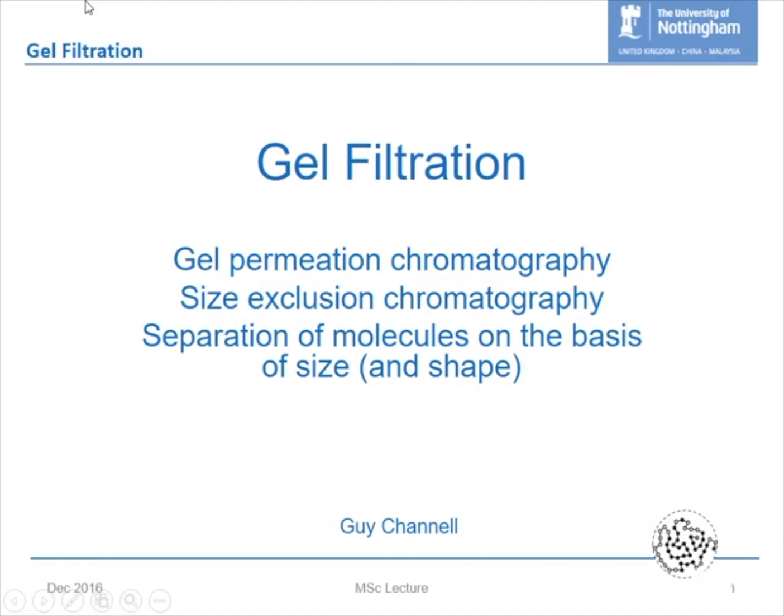Good morning, everybody. I'm going to talk this morning about gel filtration. Like many techniques, it often has a number of different names that you can use. We've got gel filtration, we've got gel permeation chromatography, we've got size exclusion chromatography, and actually size exclusion chromatography is my preferred description for it because it is actually quite descriptive in terms of what you do.